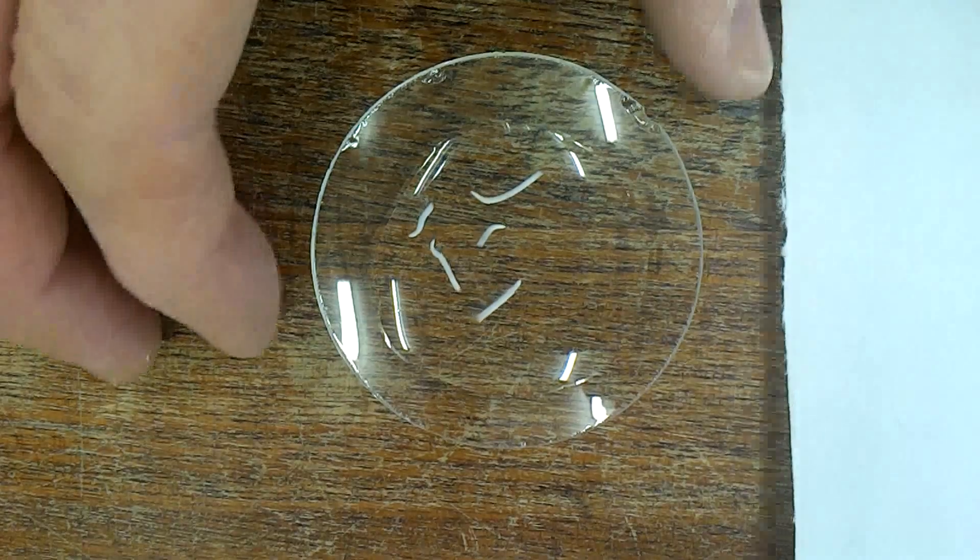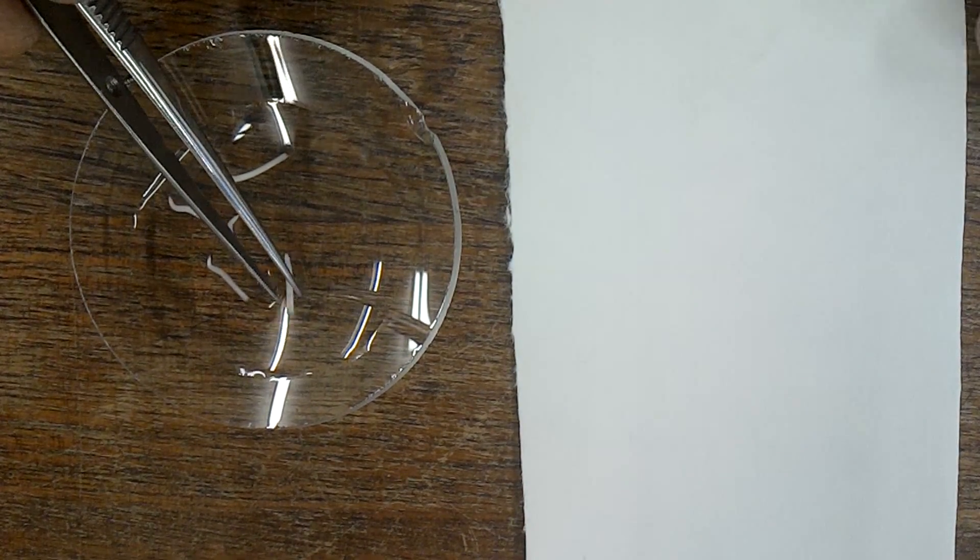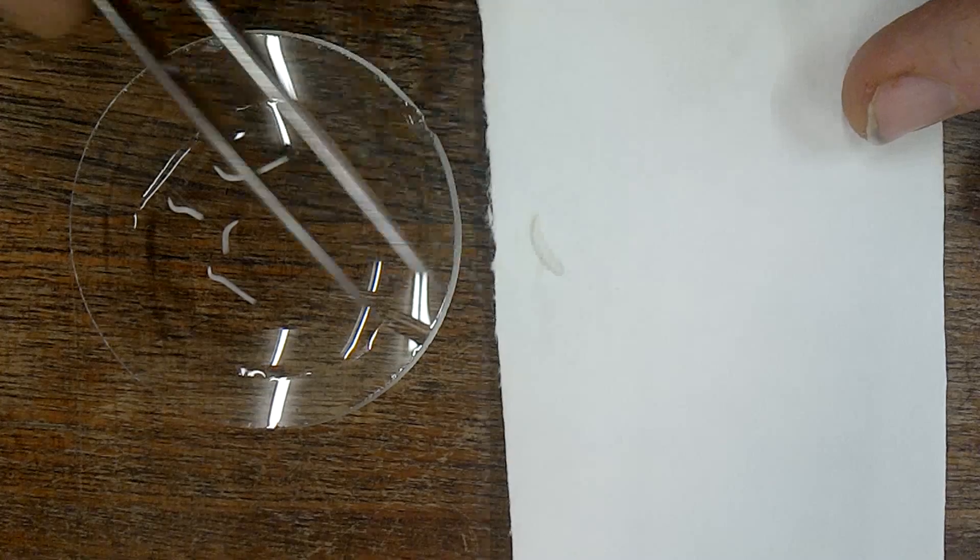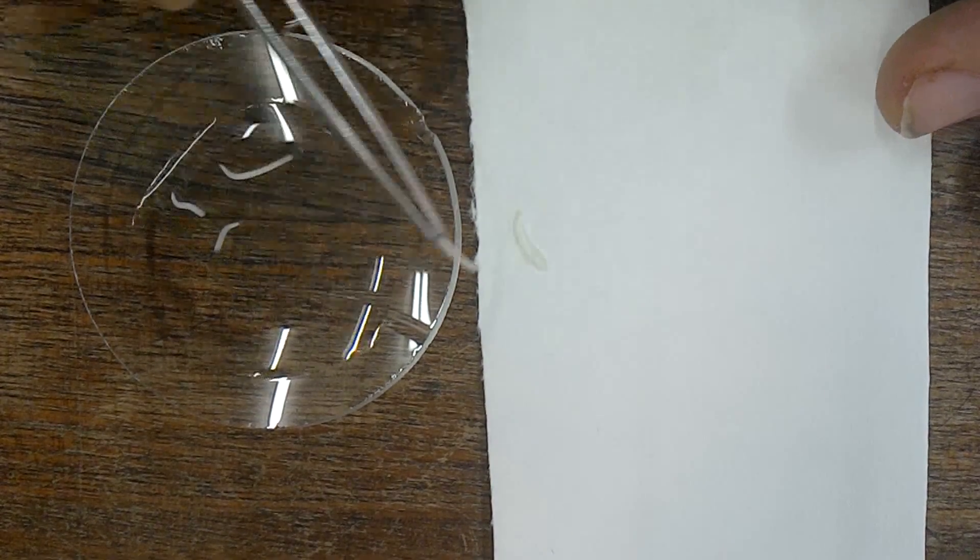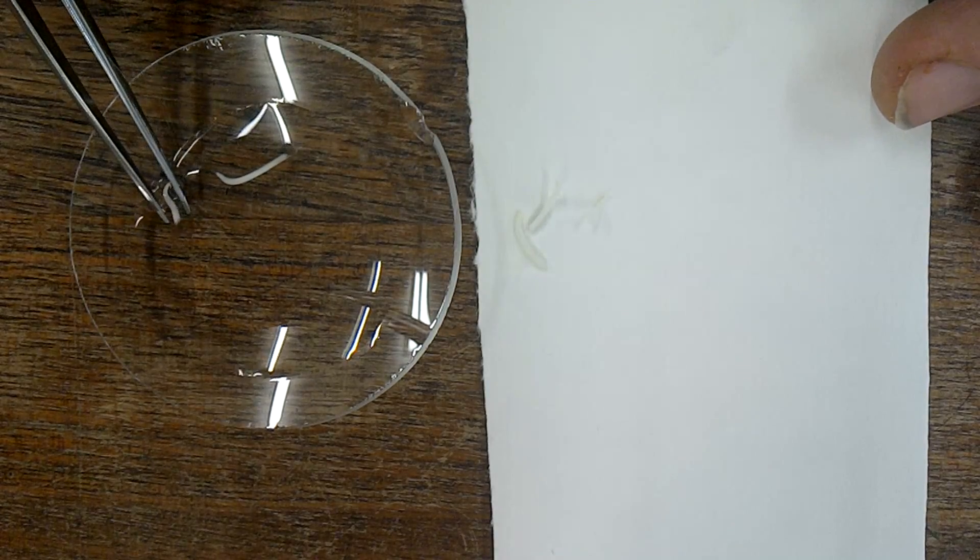Then we need to blot them dry, so we'll transfer them onto some blotting paper. Very carefully—be careful not to squash them too much, they'll be delicate.